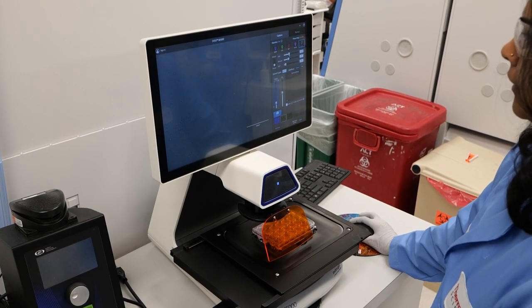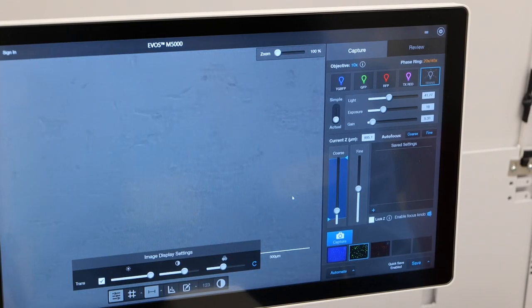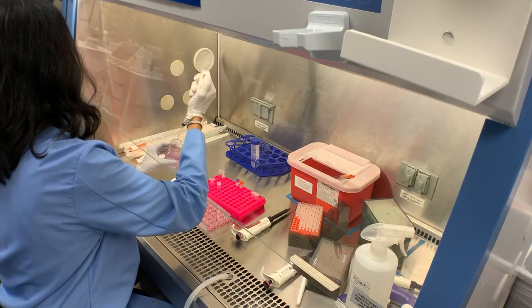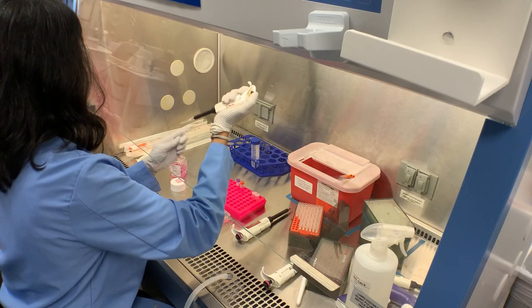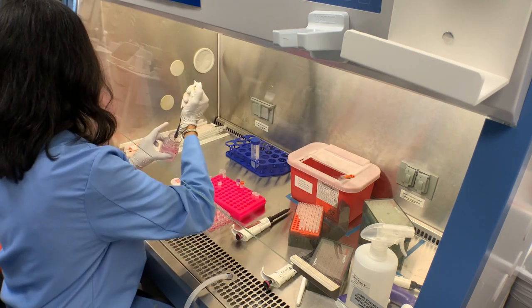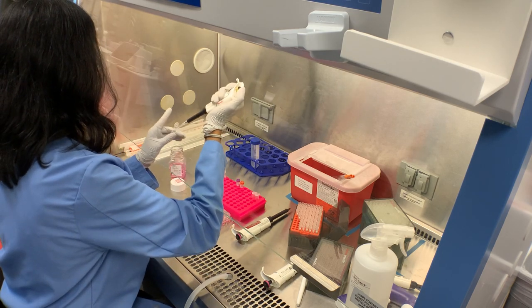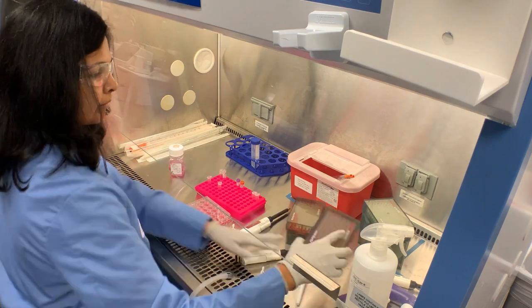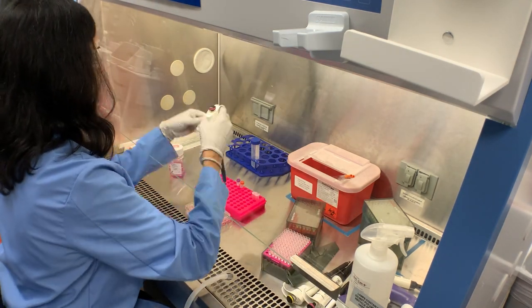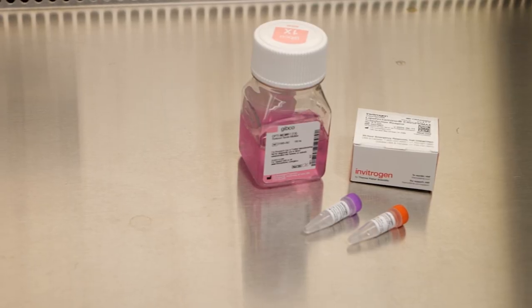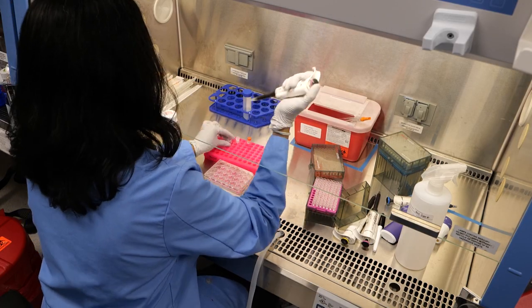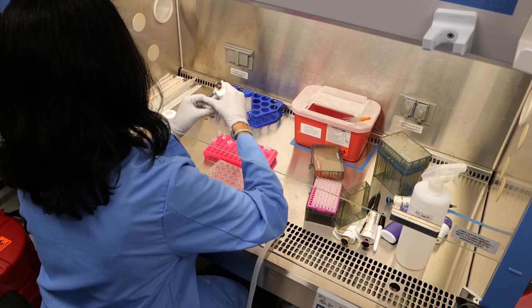On the day of transfection, first check your cell health and for signs of contamination before proceeding. Once your cells are deemed healthy, a new gRNA needs to be resuspended in TE buffer to a concentration of 100 micromoles and stored at minus 20 degrees C. For each gRNA, prepare one RNase-free microcentrifuge tube with gRNA, TrueCut Cas9 protein, Cas9 Plus reagent, and Opti-MEM medium.